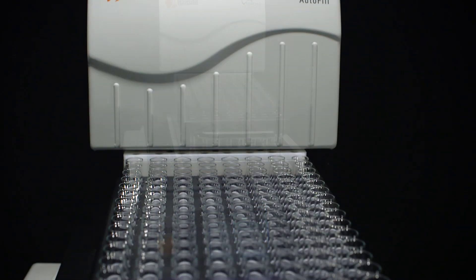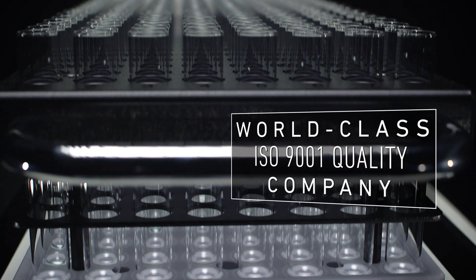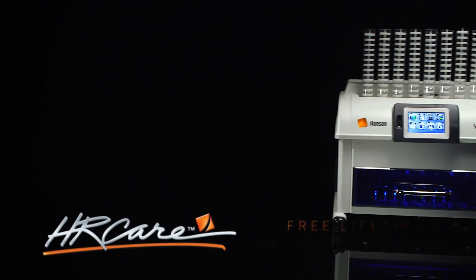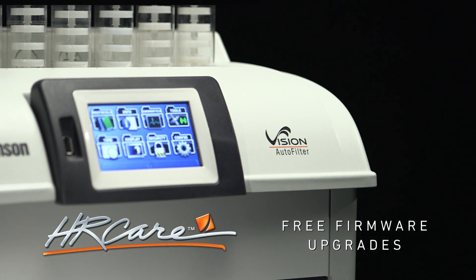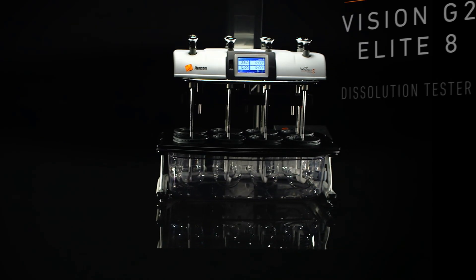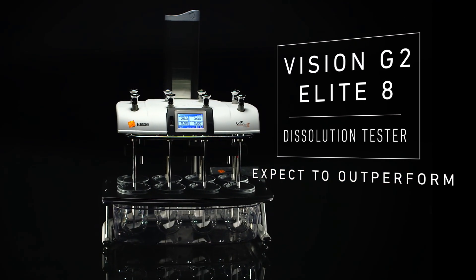As part of our ongoing commitment to worldwide customer success and quality products, Hanson Research offers free lifetime technical support and free firmware upgrades on all Vision products. The Vision G2 Elite 8 Dissolution Tester — expect to outperform.